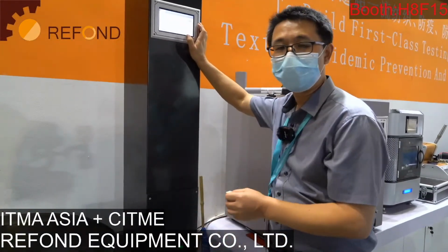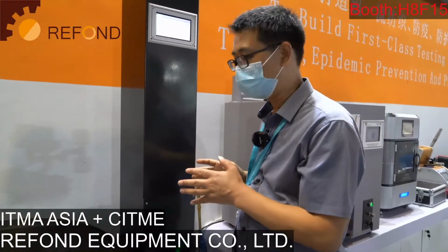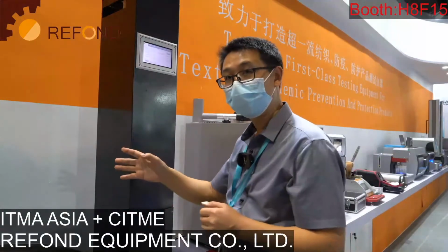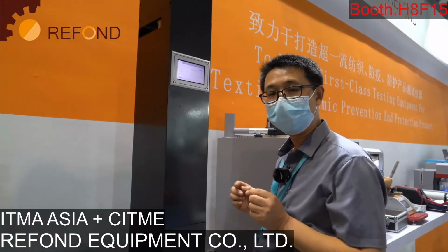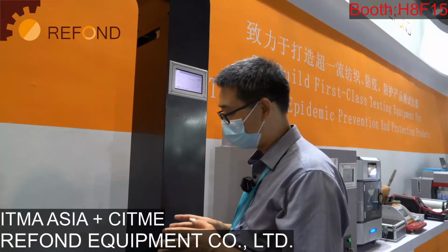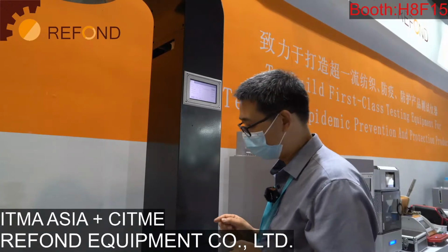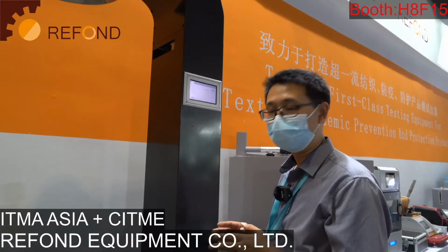For the ISO testing standard, working with this machine, they need a centrifuge, which is used to remove the excess water after doing the water repellency test. After removing the excess water, they need to weigh the wet specimen, then compare it with the weight of the dry specimen. They can calculate how much water has been absorbed by the specimen.